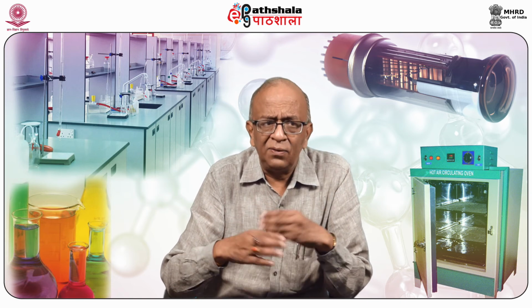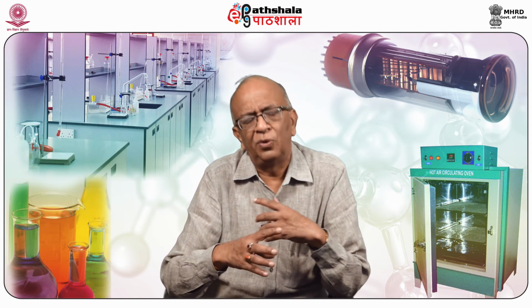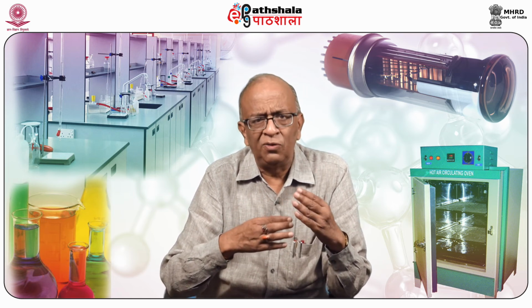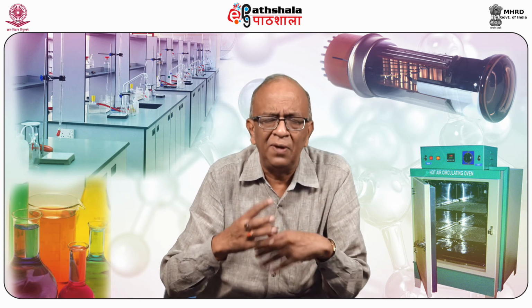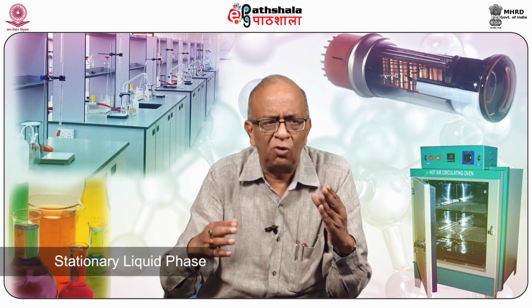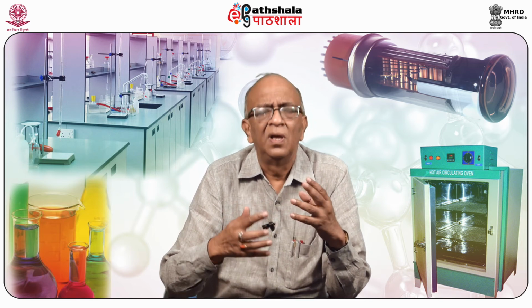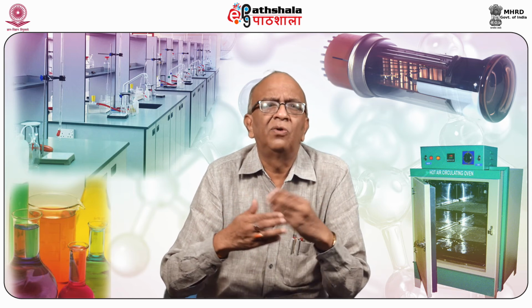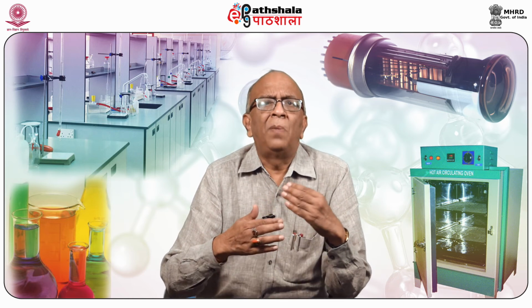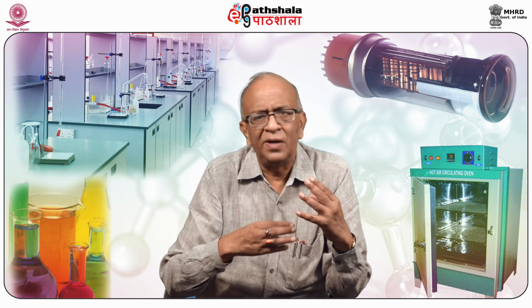And here, when separation is taking place, then theoretically different types of interactions are possible. The components which you are separating are present in the mobile phase in gaseous state, and they are moving on the stationary liquid phase. So different types of interactions are possible. Suppose dipole-dipole interactions are possible. Hydrogen bonding may form. Certain types of diffusion may take place. So by that, differences in their partition coefficient arise, and due to those differences, separation takes place at different levels.